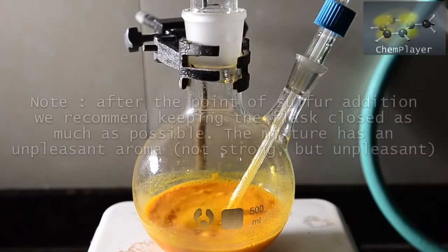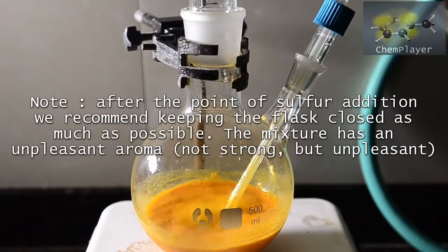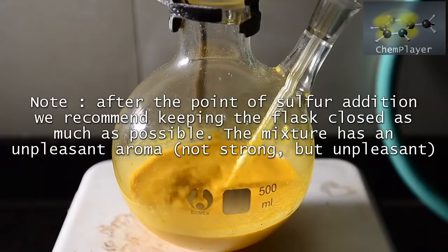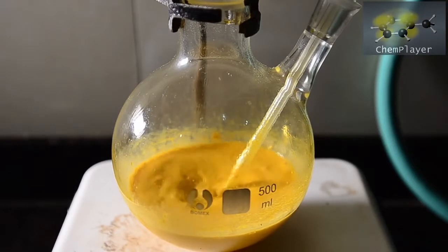Over this time the mixture became a paler orange still, and the solid completely broke down, forming a fine powder in suspension in the liquid. The condenser keeps anything from escaping, but if you open the flask there's a pretty mean sulfurous aroma at this point, which is quite unpleasant.